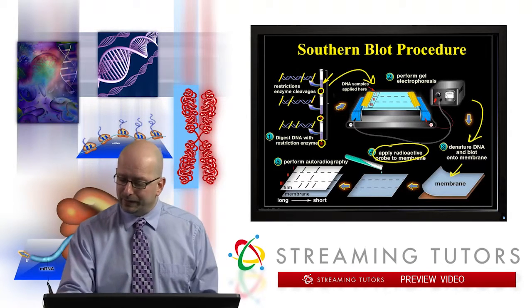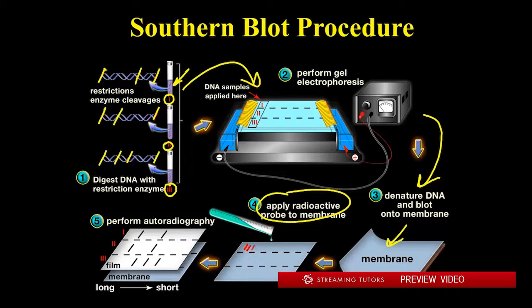So look, guys, you can't see it, but this is genomic DNA, right? There's just tons and tons of fragments all over the place here. You can't see them, and the point is the probe's going to come along, and it's going to say, oh, here's 2 places where it's binding. And that's what you're going to be able to see. And the pattern is likely going to be different for a given individual versus another. All right? So when you do the autoradiography, all you see are the fragments of interest. You don't bother getting to see all those other probably hundreds or thousands of fragments that are hanging around there. So you get a pattern.